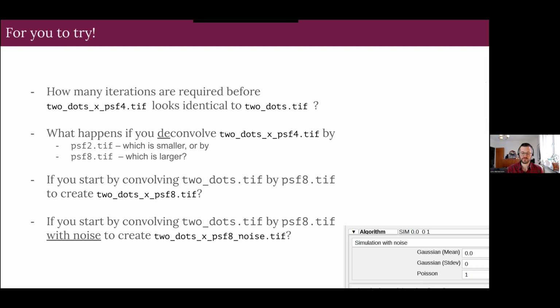But the idea is simply that, in this case, if you have an image with just 2 points in the PSF, it will place the PSF on top of each of these bright pixels. But if you want a longer explanation, I recommend going to Wikipedia and reading about convolution.